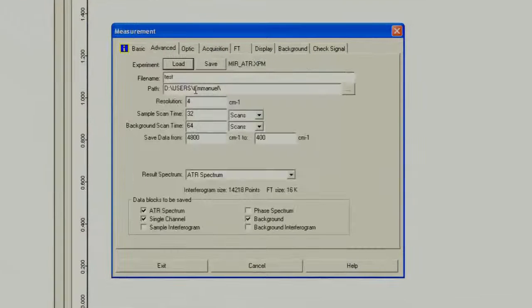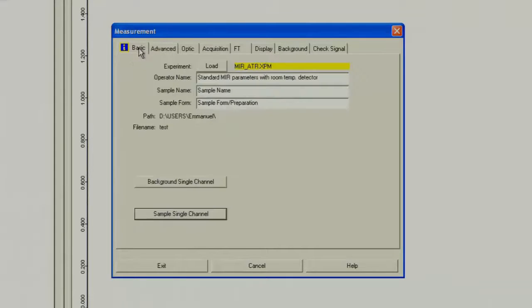So go to the Advanced tab, make sure your file is named, and make sure the number of scans is correct. Now go back to the Basic tab, and click Sample Single Channel.